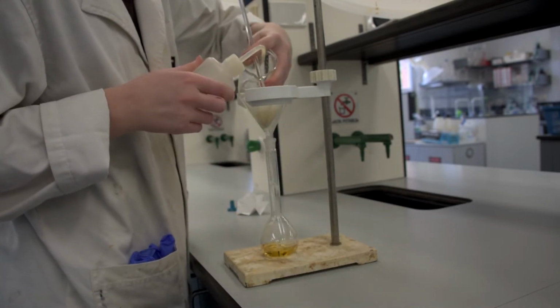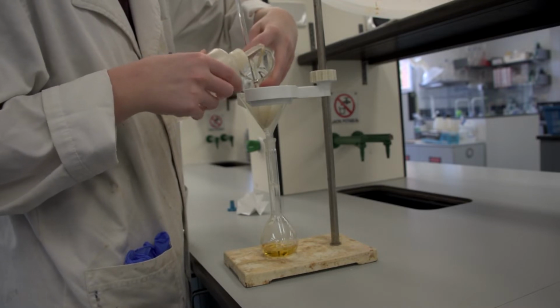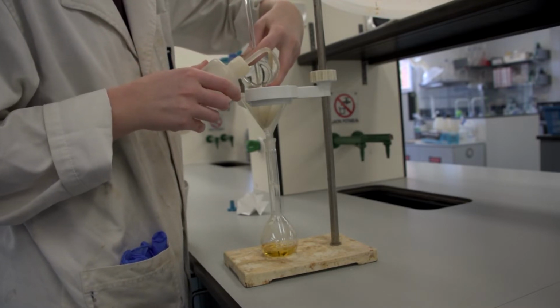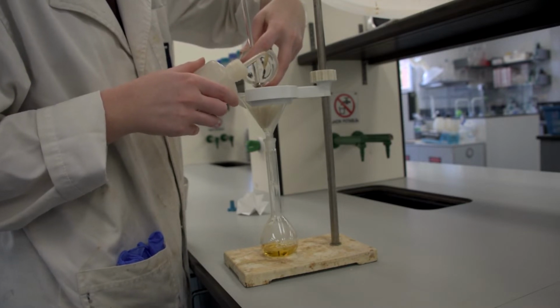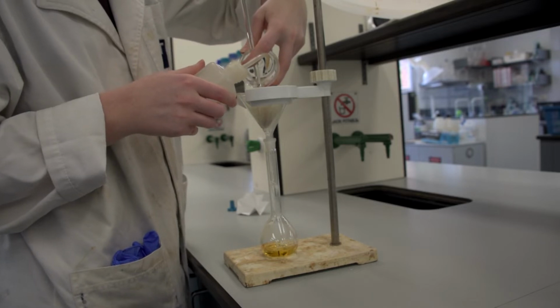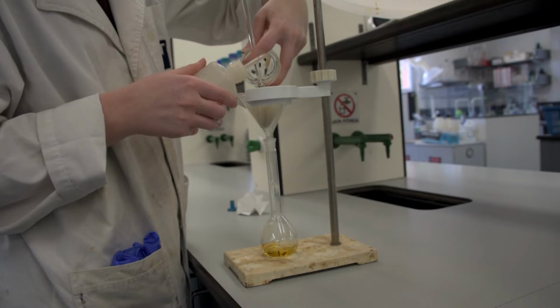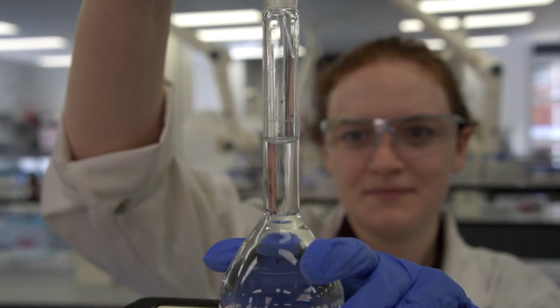This utilized a glass rod placed on top of the beaker, and a stream of water from the wash bottle was used to ensure complete transfer of both the solution and the solids. This quantitative transfer technique is also demonstrated in the front of the CVB202 practical manual. Once the solution is filtered, the filter paper was washed, and then also the funnel. The solution was then made up to the mark with deionized water.